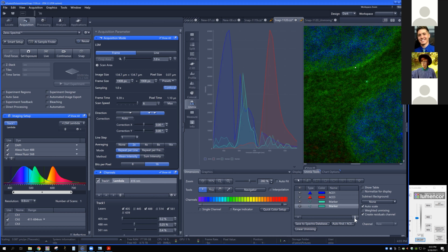One of the things that I can do to try to clean this up a little bit would be to use a region tool instead. This is going to collect signal over a larger area, and so the noise is going to look a lot better in this case. This curve is a lot smoother in the end, because we are averaging across several pixels, but there's enough dark ones there that you can see that we're really taking a hit in terms of our peak. So if you have a region where there is a nice intense spot, this is a great way to go. And something like this might actually work pretty decent. But I'm going to give it a try with this other one here, even though it's noisy, and we're going to see what we get.